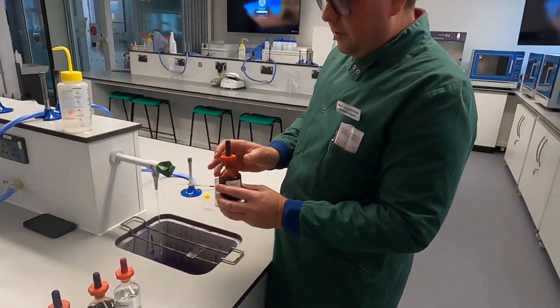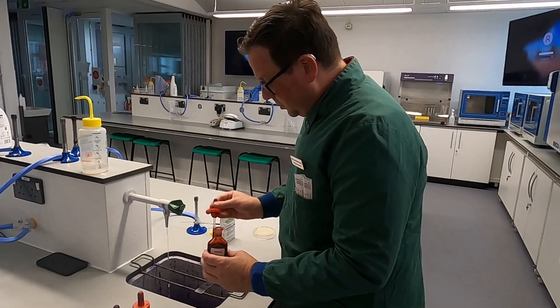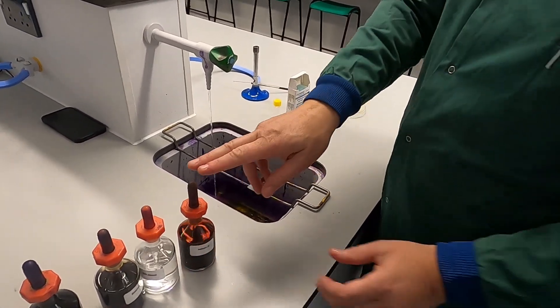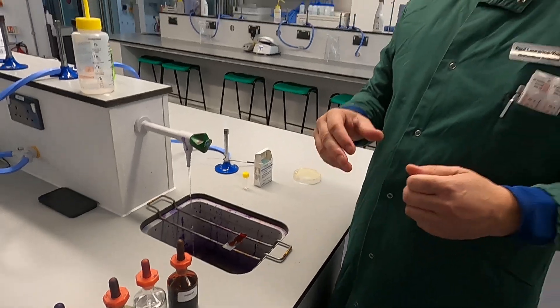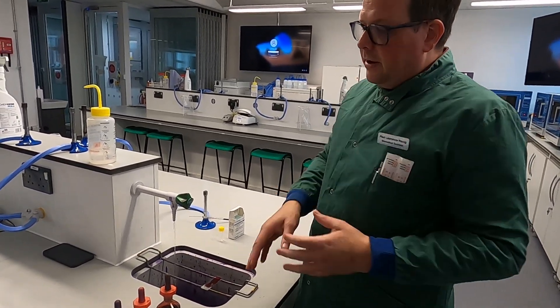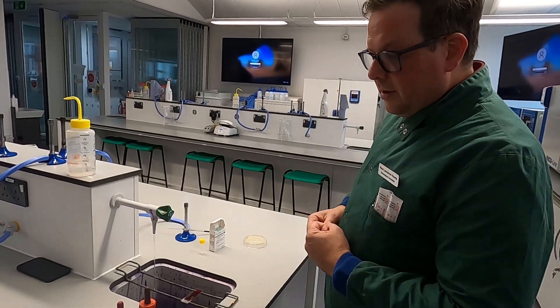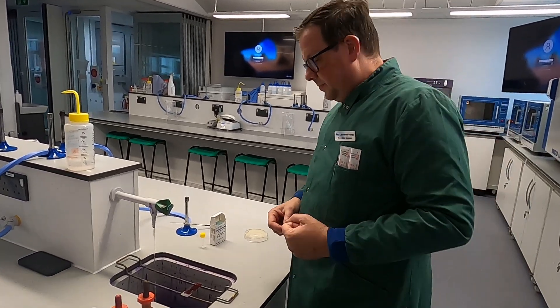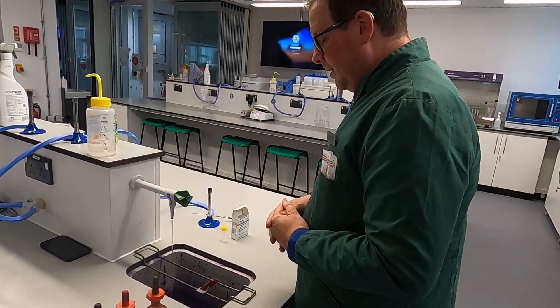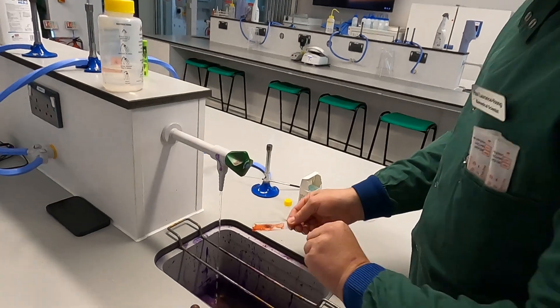Finally, we go for the safranin, which gives all the bugs a pretty pink colour if they have the appropriate coat. You drop that on and this one is like the granddaddy of all stains — it needs a little bit longer to do its business. Give it about double what you would normally give your crystal violet or the Gram's iodine. Happy days — I reckon that's enough. Wash that off.